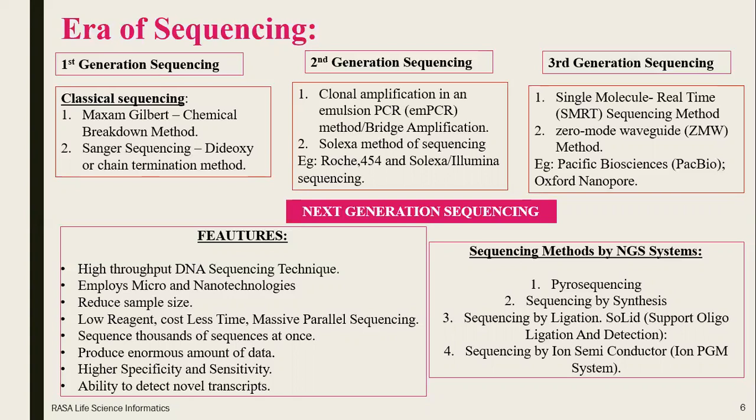Now, this is the conceptual basis underlying the sequencing in 454 and Ion Torrent. Bridge amplification produces clusters of clonal DNA population in a planar solid phase PCR reaction, as occurs in the Solexa or Illumina sequencing. In the early years of second generation sequencing, perhaps the third major option, along with the 454 and Solexa Illumina, was sequencing by oligonucleotide ligation and detection from Applied Biosystems, which became Life Technologies following a merger with Invitrogen. I'm just giving you an idea about the companies here.